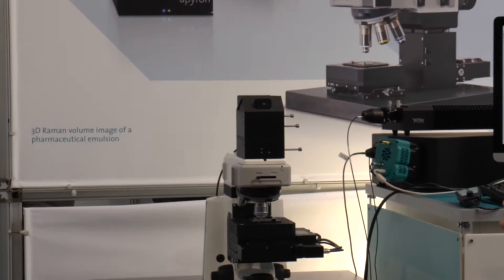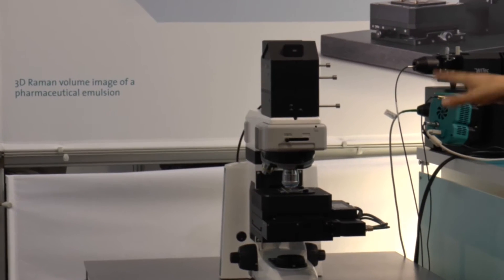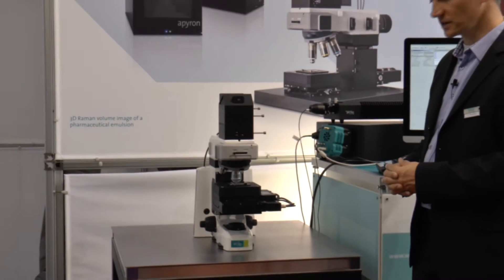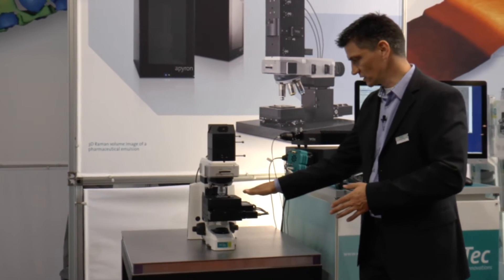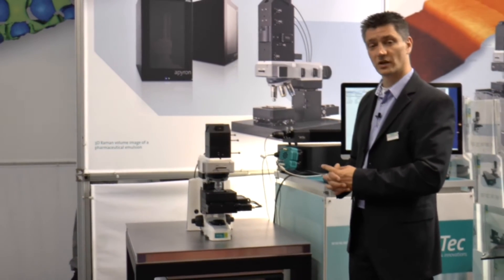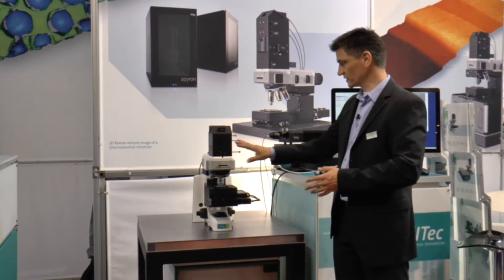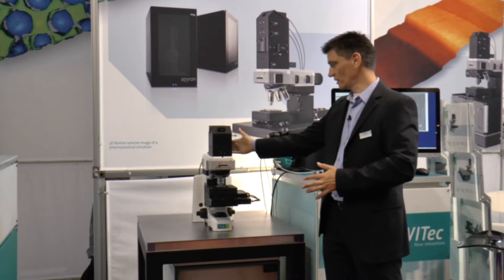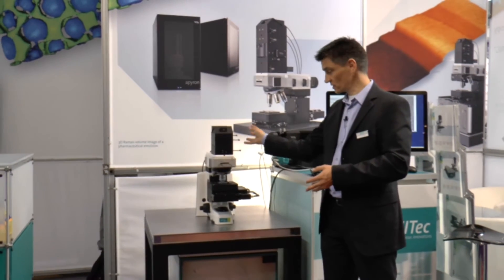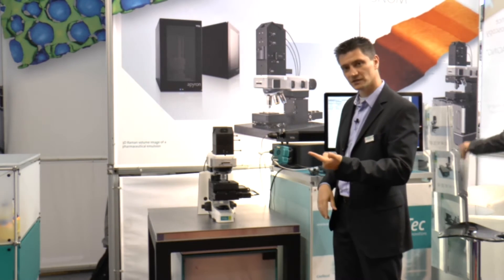The XS itself comes in two flavors. First is a pure manual system where you position and focus your sample manually, then you have access to spectra or time series. The version shown here is with a motorized stage, which achieves positioning accuracy of less than half a micron. The Z-focusing is still manual. You have access to multiple laser lines and couplers, a high-definition video system, and the detection beam path. The whole system is based on a Zeiss microscope with Kohler illumination, giving access to dark field, DIC, and so on.